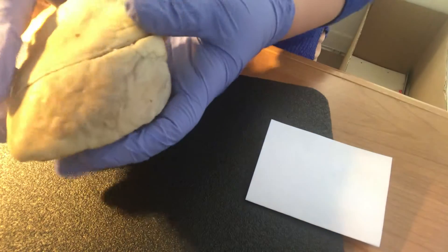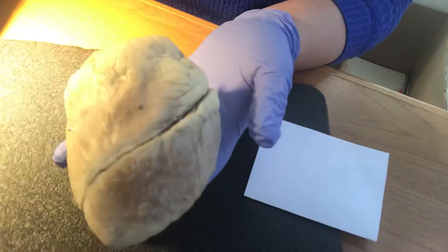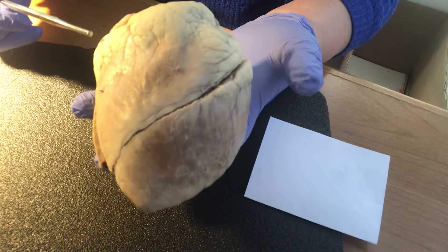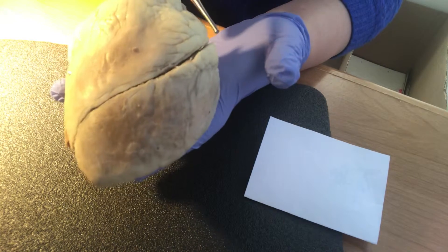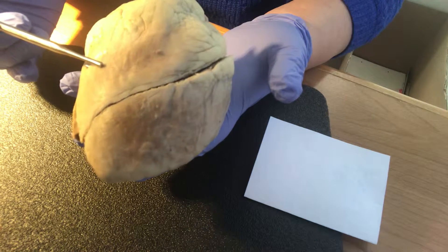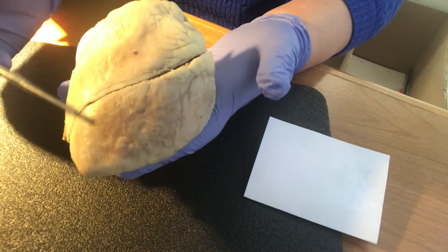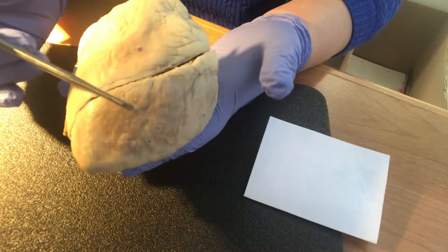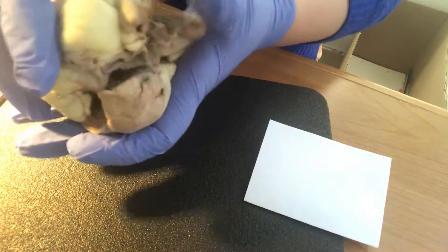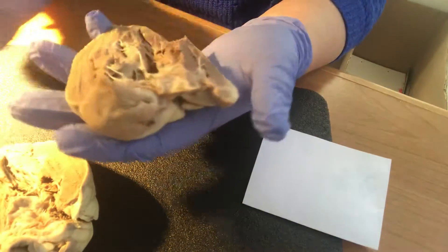This is a sheep heart. This is the right atrium, left atrium, right ventricle, left ventricle. This is the ventricular sulcus. And then I will show you the inside of the sheep heart.